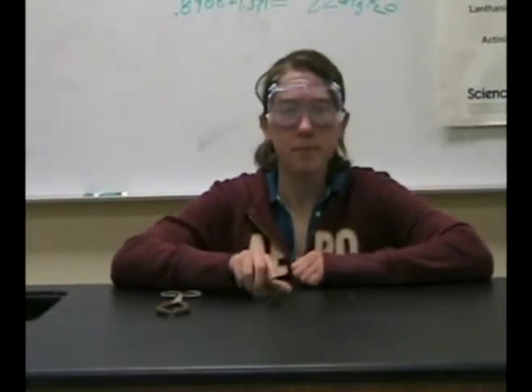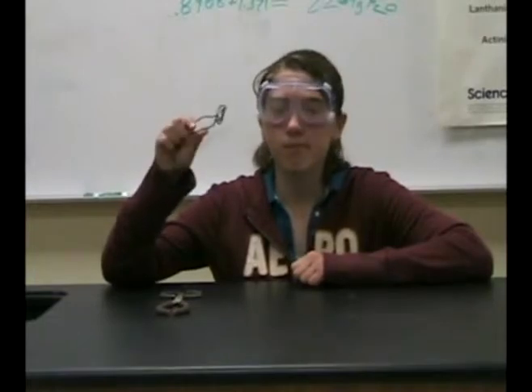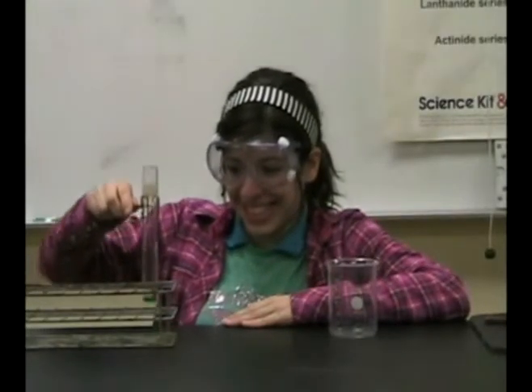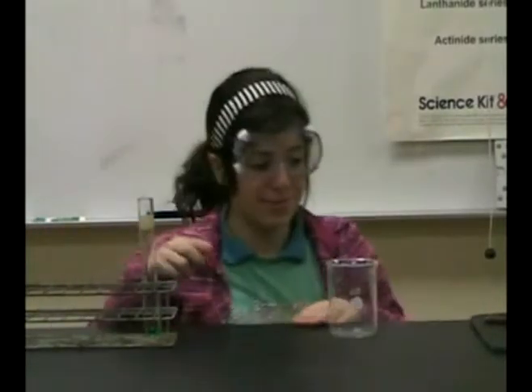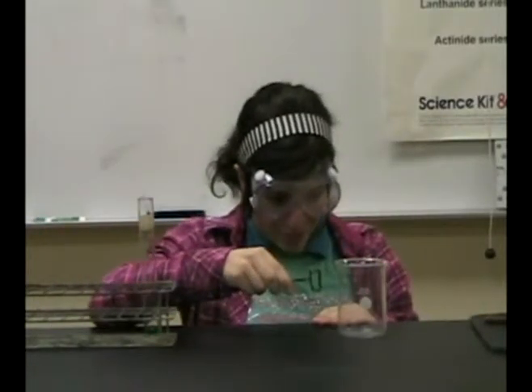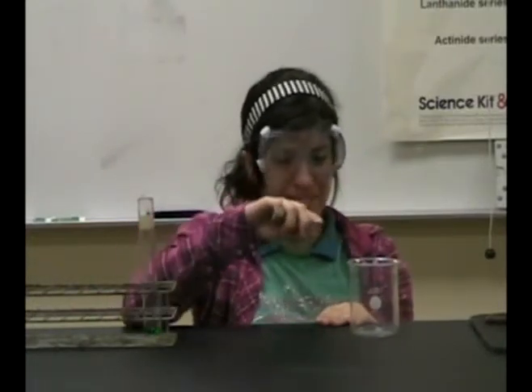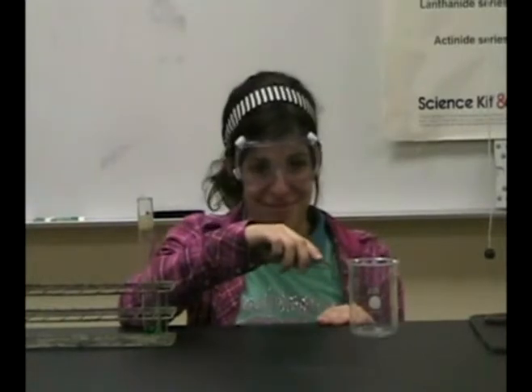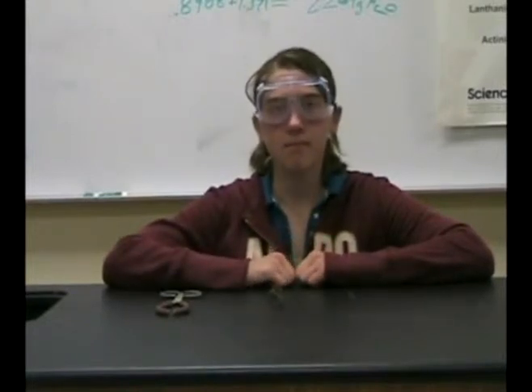Test tube clamps. Test tube clamps are for picking up test tubes and test tubes only. As you can see, each of these grippers has a specific purpose and thing it can pick up. They should not be used for any other purpose.